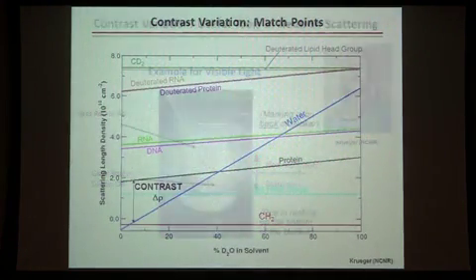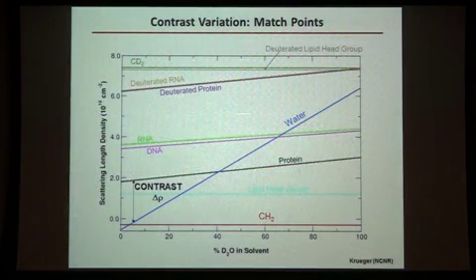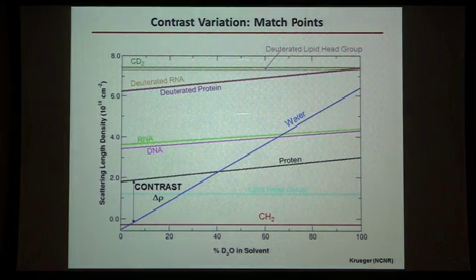And that's Susan Krueger, who's one of our NCNR scientists who helps primarily with SANS measurements, but this is her slide. So basically, if you're looking at contrast variation, what we can do in a complex assembly of a lipid protein system is we can match one of the components and basically blank it from our experiment. So you can match the protein or you can match the lipids, and so you can look at scattering selectively from one component of your sample.